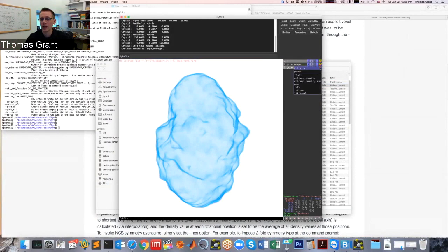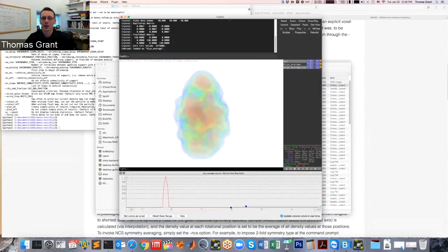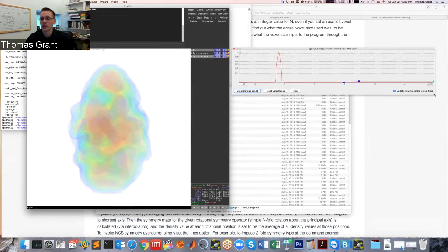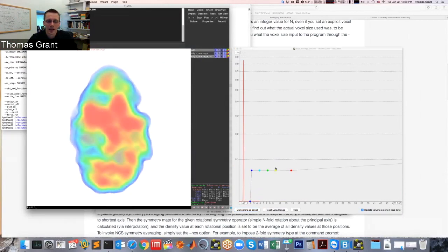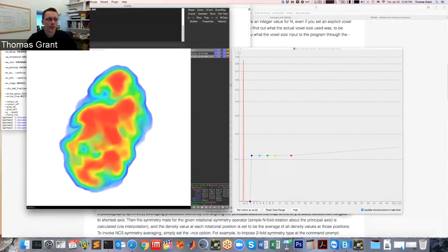But you can make it nice and colorful and show how the density changes inside the particle, which is really nice to be able to see. And you can use this volume panel. Sorry, I kind of went fast there. Coloring and then click panel, and it pops up with this. Again, I won't go through all the things that PyMol can do, but you can see all the density inside your object and how it changes. And so that's the basic idea there.